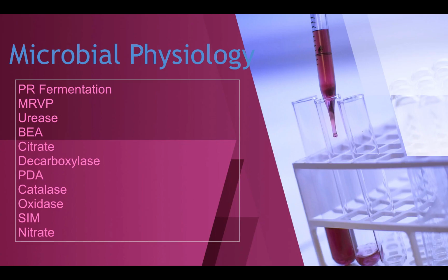So now we have wrapped up all of the tests that we typically use in our lab under the umbrella of microbial physiology. We've covered the phenol red fermentation, MR-VP, urease, bile esculin, citrate, decarboxylase, PDA, catalase, oxidase, SIM, and nitrate. These are the physiology tests that we use in the lab to aid us in identifying microorganisms.